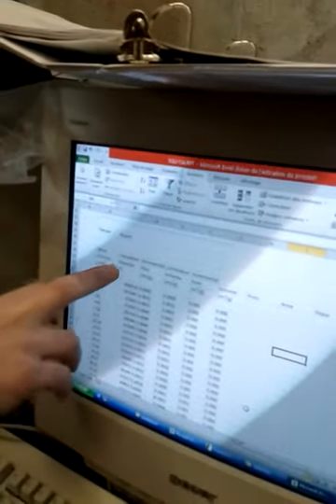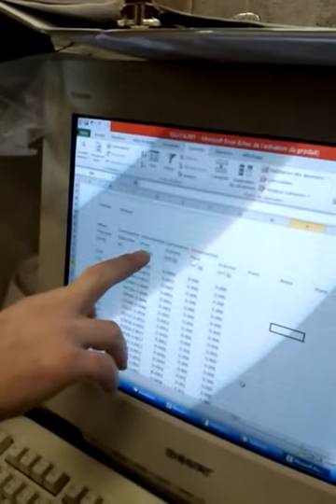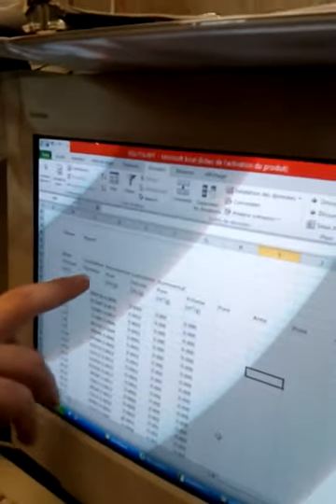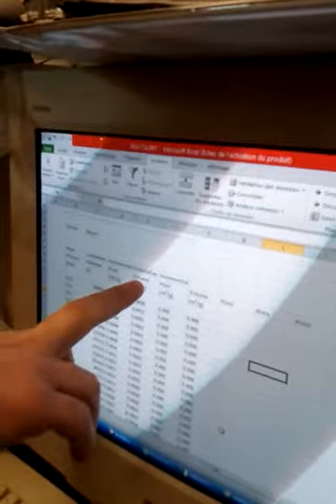Alright. So we have the diameter in angstrom, and after here we have the incremental pore, the volume of the pore having this size. Alright. In incremental, cumulative, and expressed apart in milliliter per gram or in surface, considering that the pores are spherical. Okay.